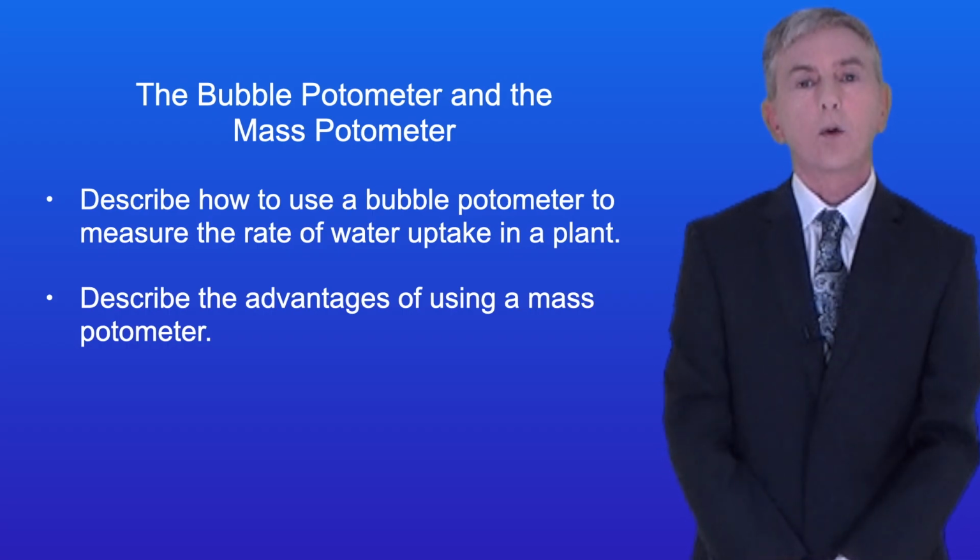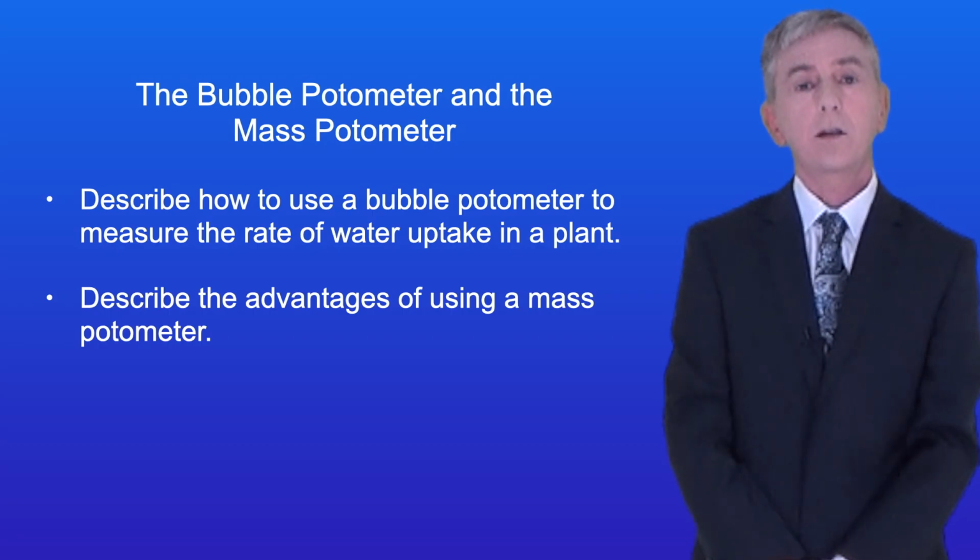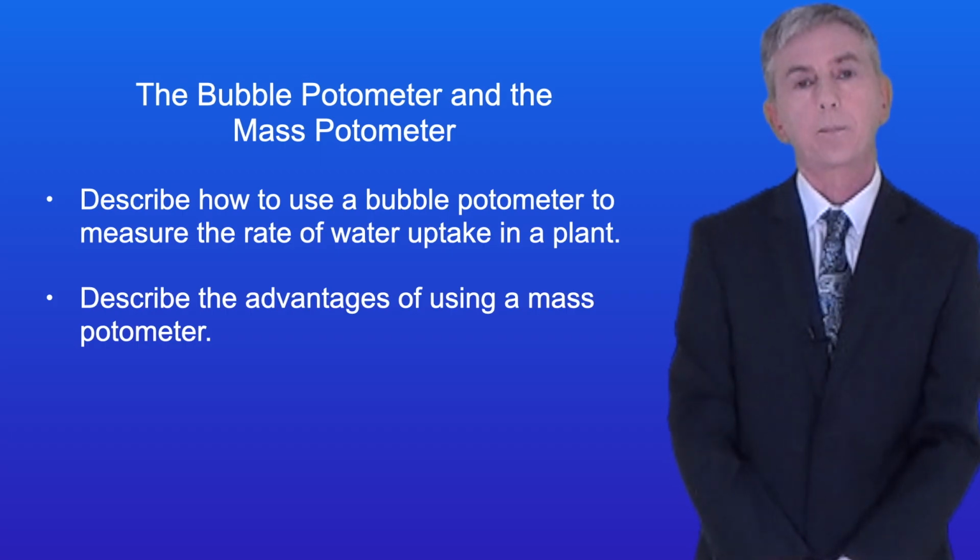By the end of this video, you should be able to describe how to use a bubble potometer to measure the rate of water uptake in a plant. You should then be able to describe the advantages of using a mass potometer.